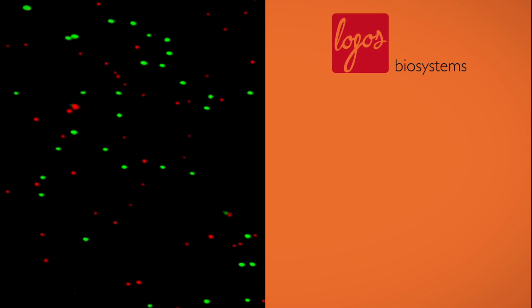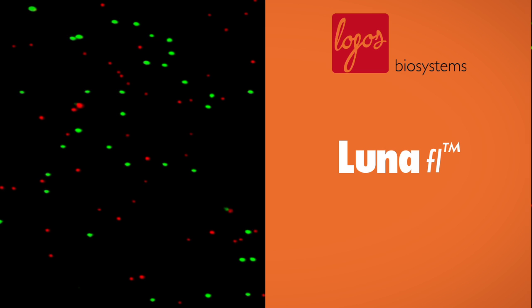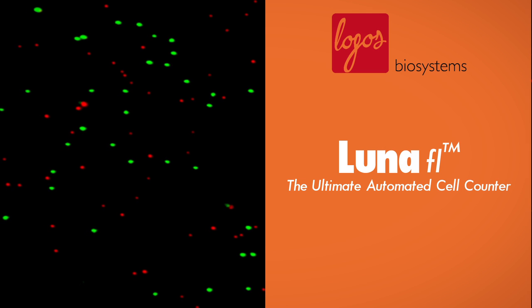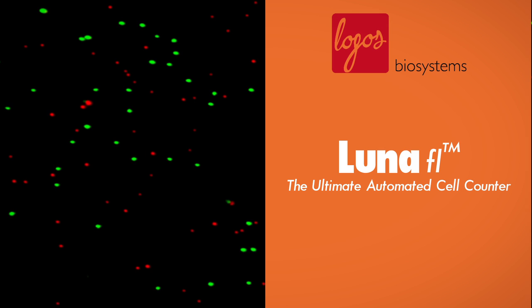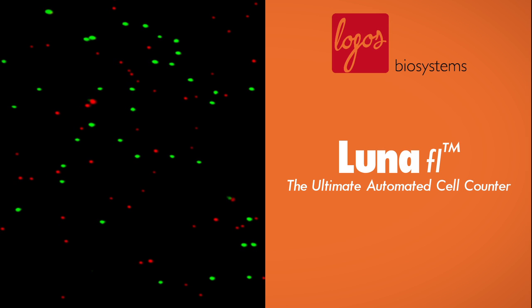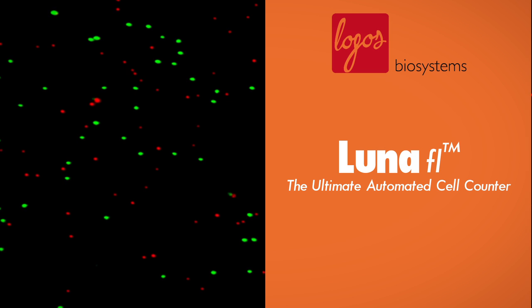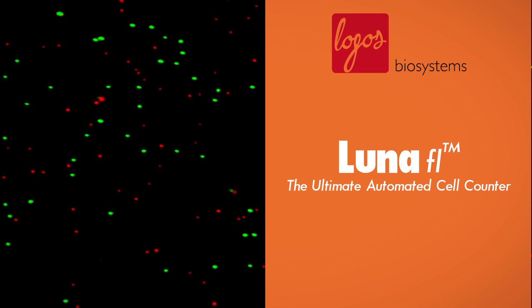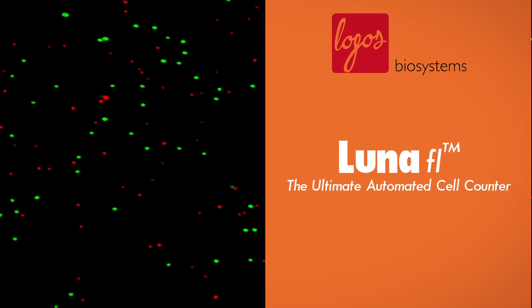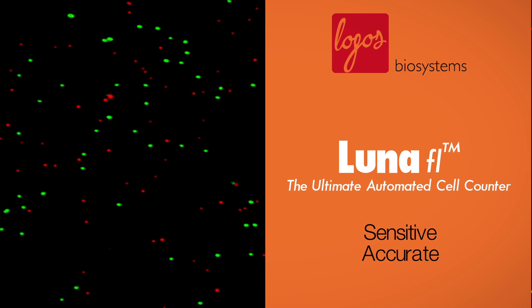Logos Biosystems introduces the Luna FL Automated Fluorescent Cell Counter, a quantum leap for automated cell counting and cell viability analysis. Overcoming the restrictions of bright-field image-based cell counting, the Luna FL provides sensitive and accurate live and dead cell counting results without limitation of cell type.